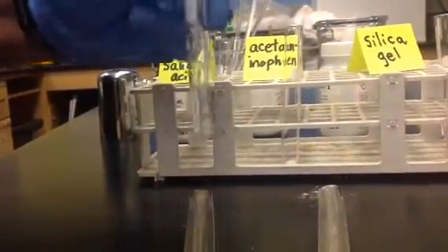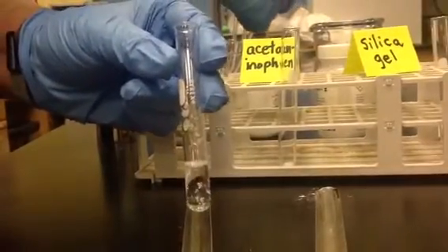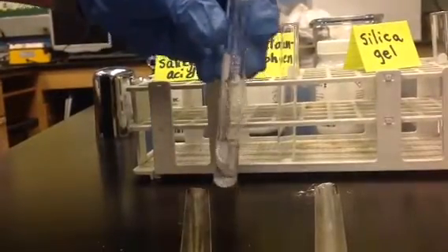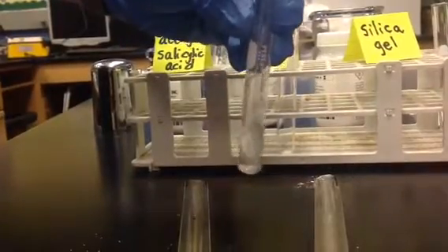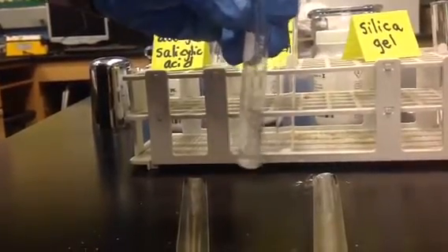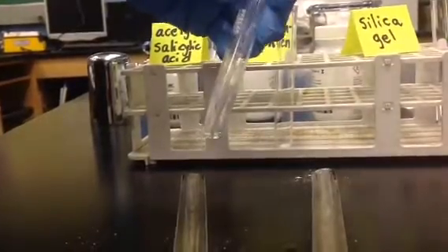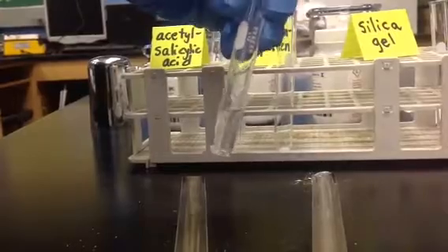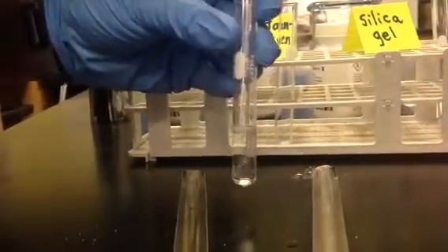And I need to stir this. Flip it over. You can see the solid on the side of the test tube. I'm going to add some more sodium bicarbonate.